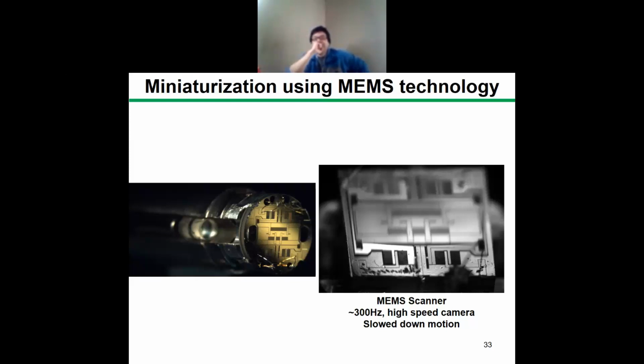Yield is high. It's not that linear. So a MEMS scanner, once you're getting small, it's not that linear. That's why you need an algorithm. For example, if you travel using sinusoid, sinusoid is not that linear, right? But since it's sinusoid, you know the pattern is sinusoid. So every time we have to characterize it based on the PSD.